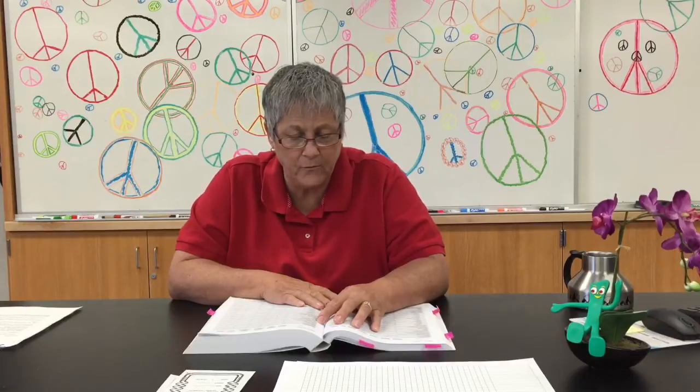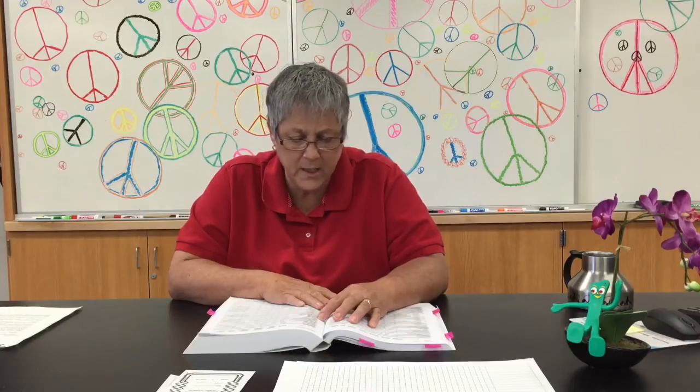Now, the vocabulary here in Bergey's is slightly different than what I used in the lab manual, but lysine, arginine, and ornithine, those are the decarboxylation tests that we did. Motility, we're going to avoid that one. Gelatin hydrolysis, we do not have that test. KCN, we don't have. Malonate, there's a test that we have.